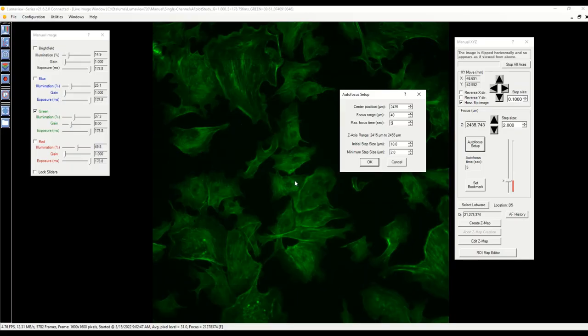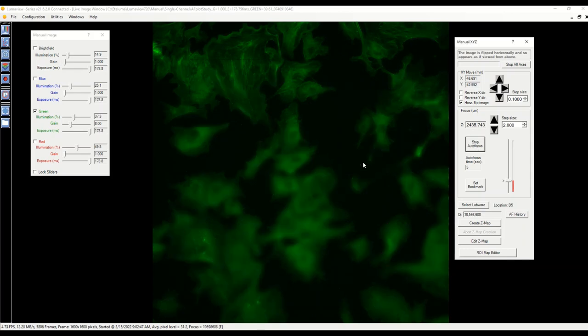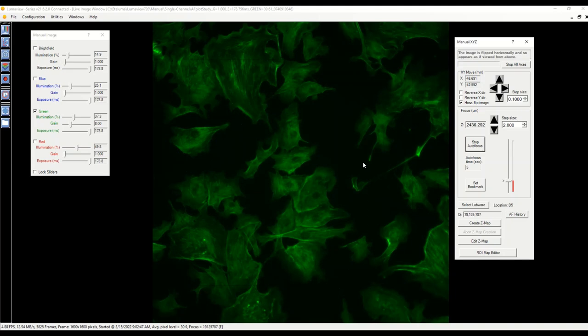If we ask the software to perform an autofocus when given an expected true focus level and a range to search, we see that the algorithm uses sequentially smaller steps in reduced range until identifying a contrast maximum.